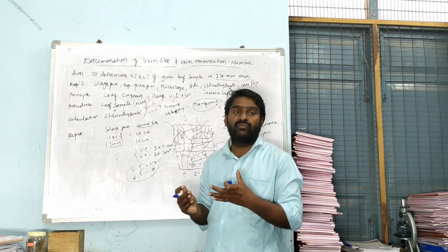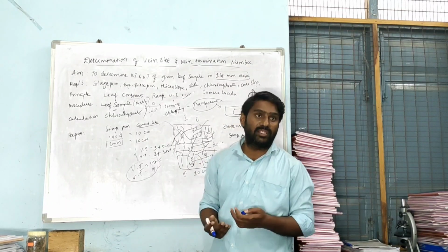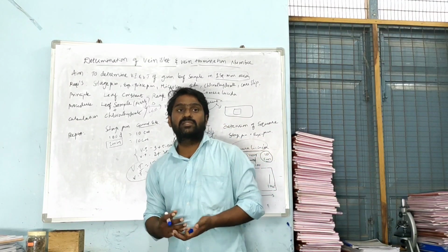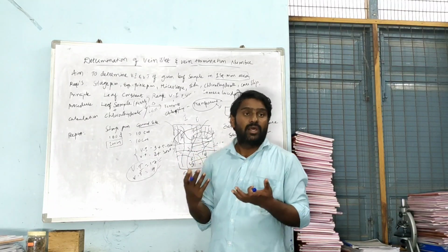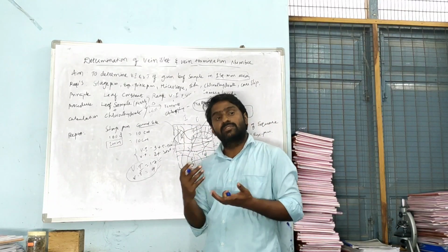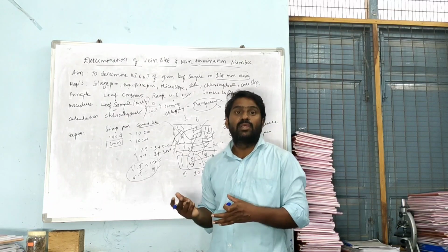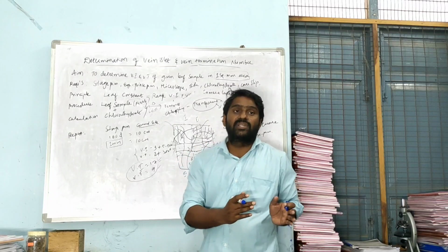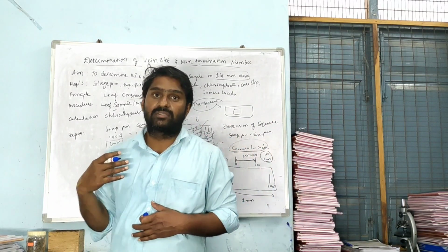Once you confirm that it is genuine, you can go for drying, then make it into powder, then observe the powder characteristics. The same powder may be used for further extraction, isolation and identification processes. After identification, such constituents should also match with the monograph of the leaf sample that is provided. So these are all the parameters that we come across.